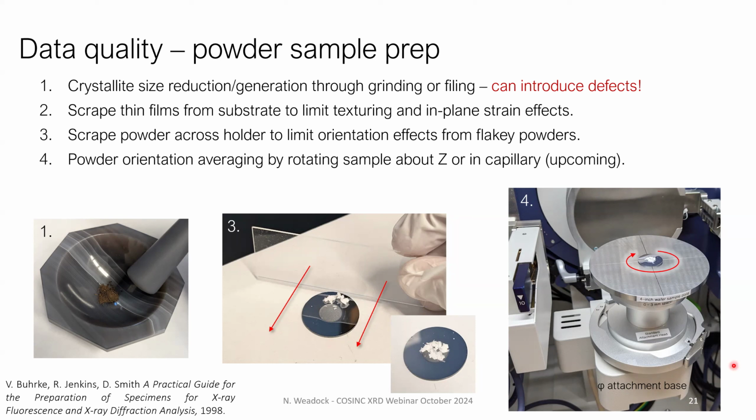And finally, you can use the phi attachment base to rotate the sample about this vertical direction. And I'm currently working on a capillary rotation stage that will rotate about the axis perpendicular to this to really help with those orientation effects.